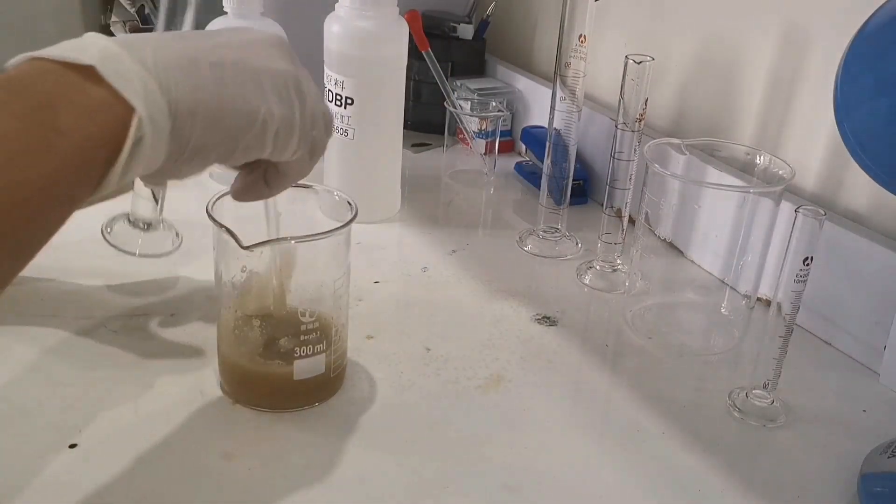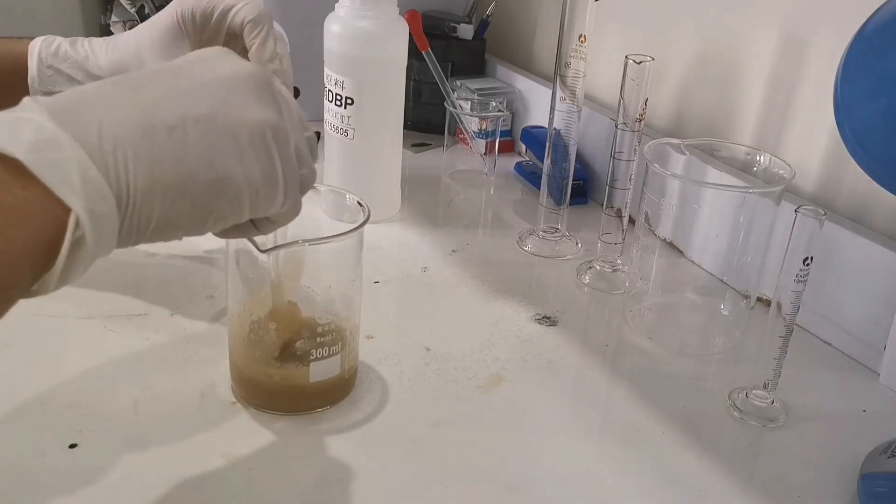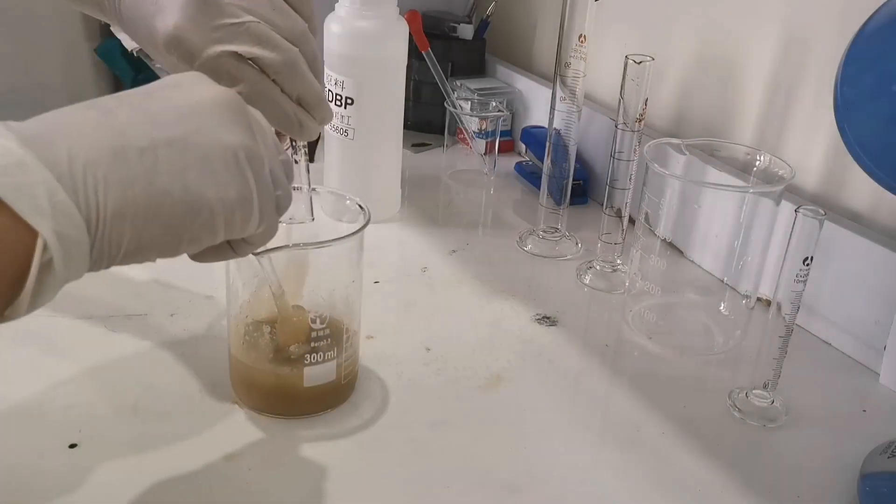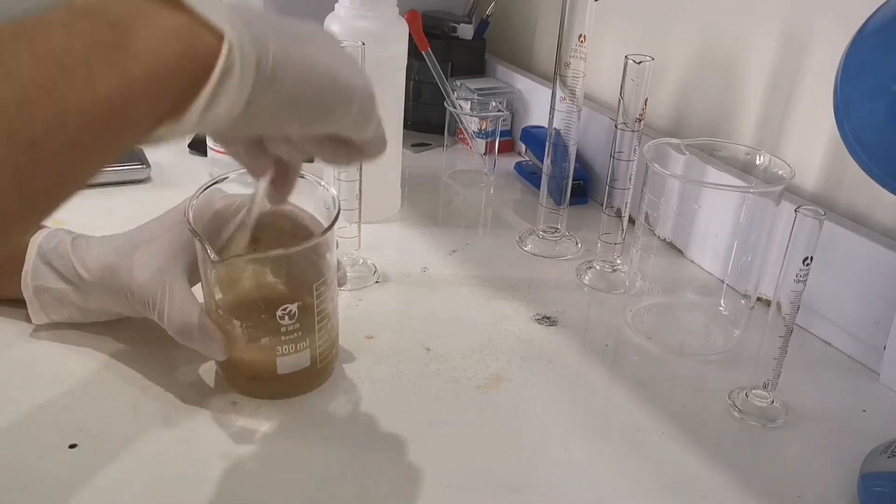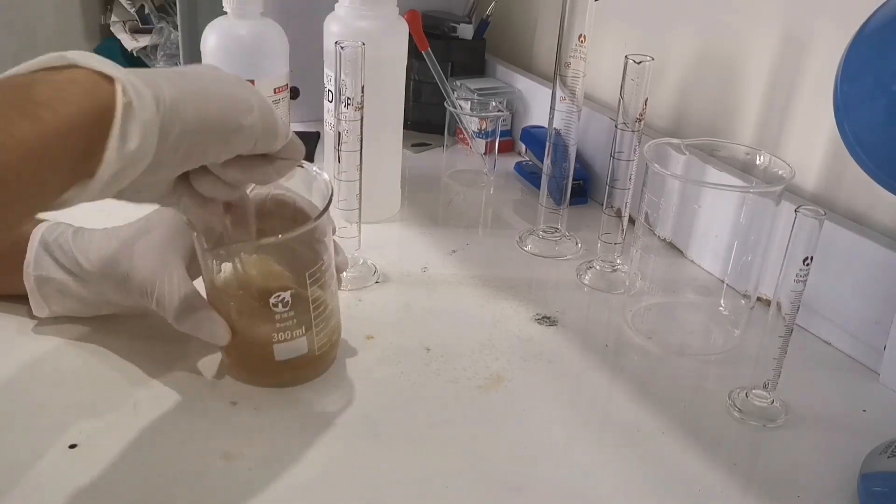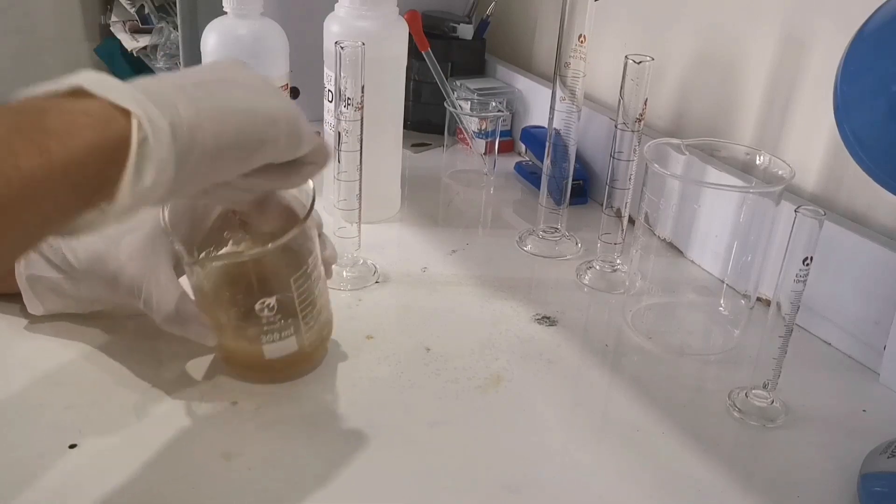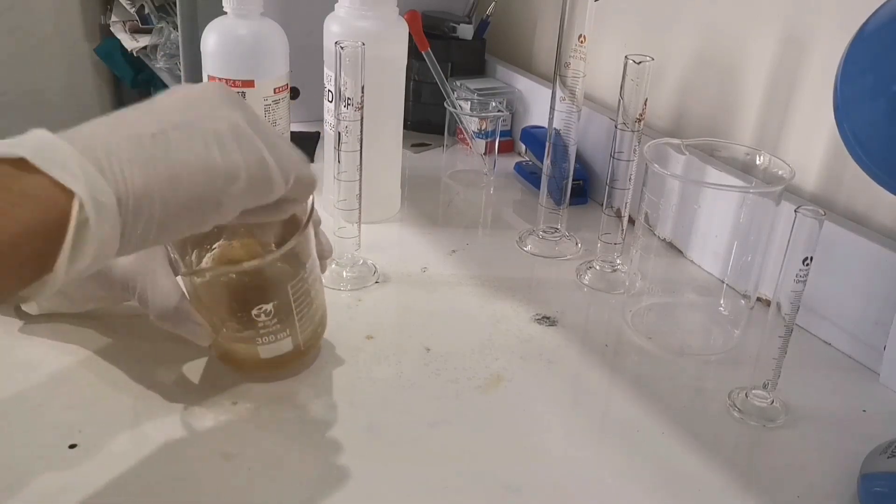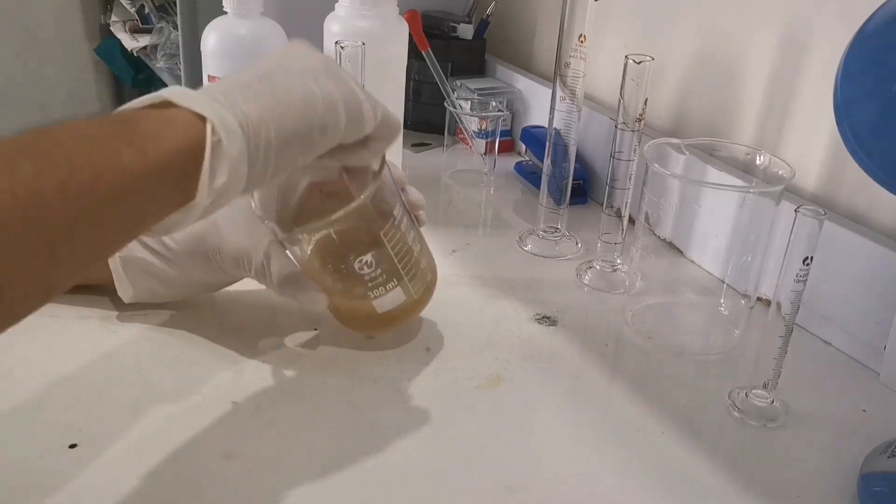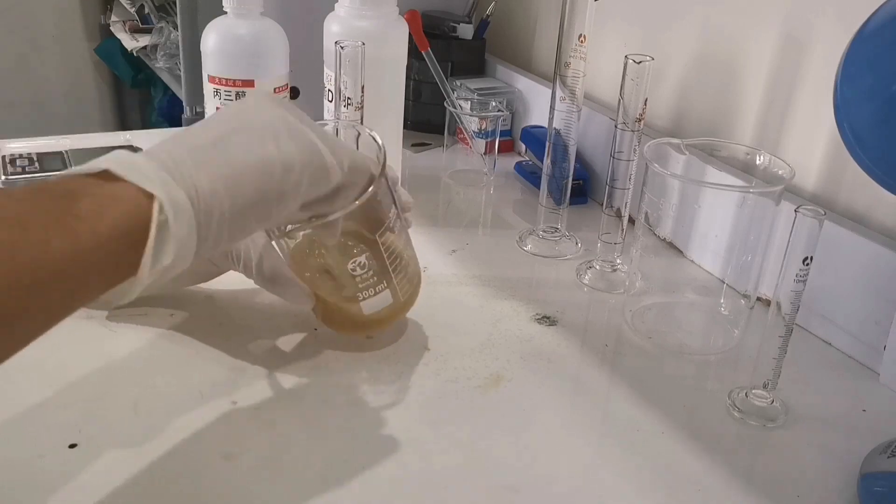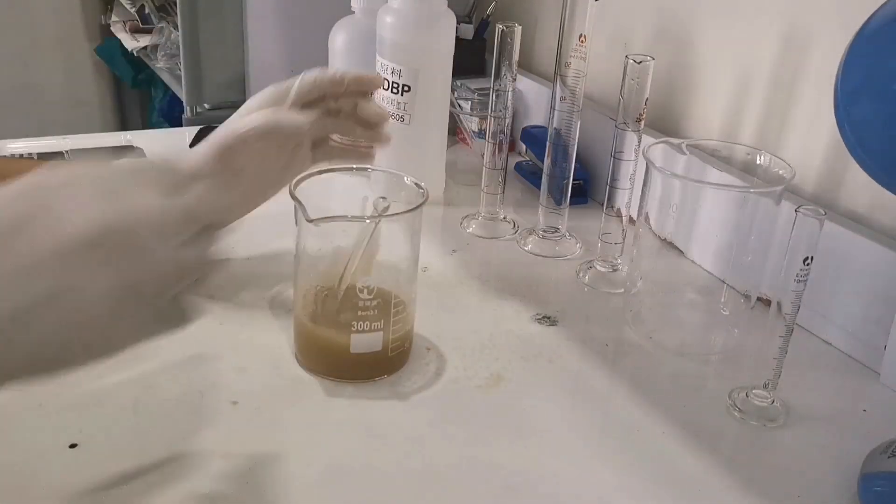Now we add our DBP into the beaker and give it a good stir. Like before, when you first add the DBP, the solution will get softer again. But after a good stirring, the solution will get hard again.